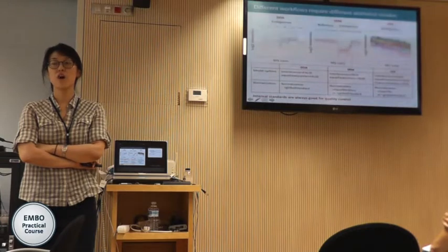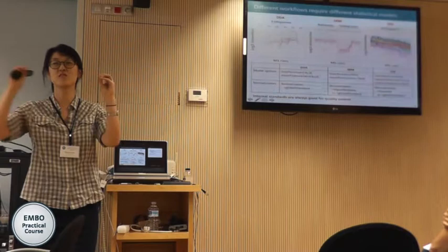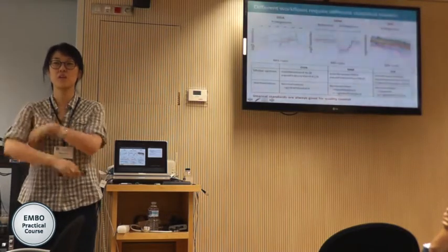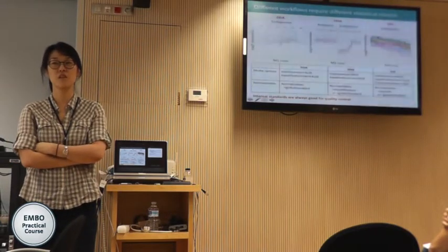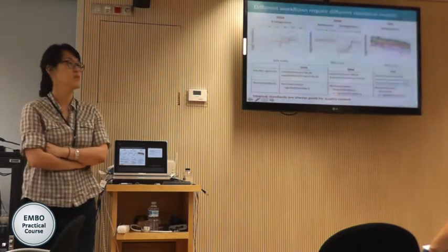Isn't it also awkward? Usually I assume the global standard doesn't have that many missing values. If you have a global standard with a lot of missing values, maybe that one is also not good enough. Yeah, you know, there's no perfect solution.